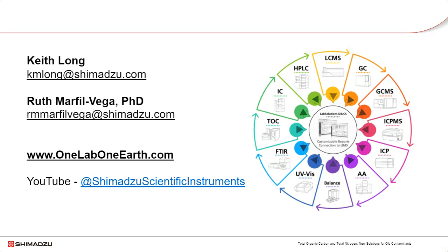Also, there was a question, someone that doesn't have the kits to remove the particles was asking what's the filter size that you recommend people filter the samples through if they don't have any of the add-ons to minimize the problems caused by high particle samples.